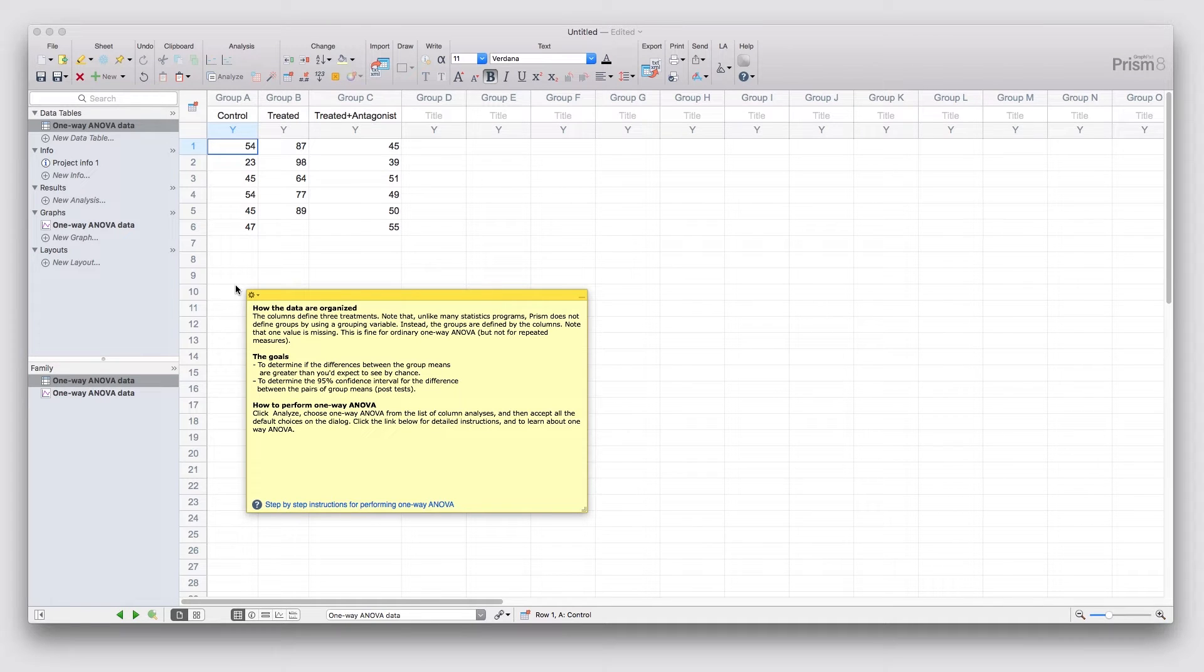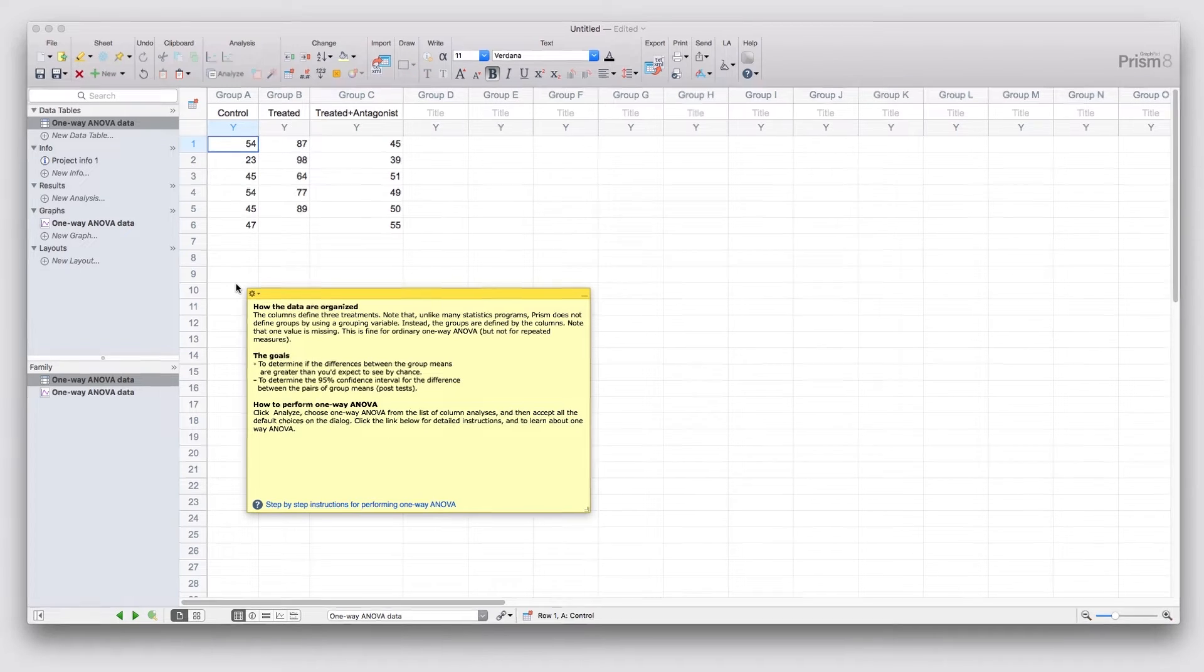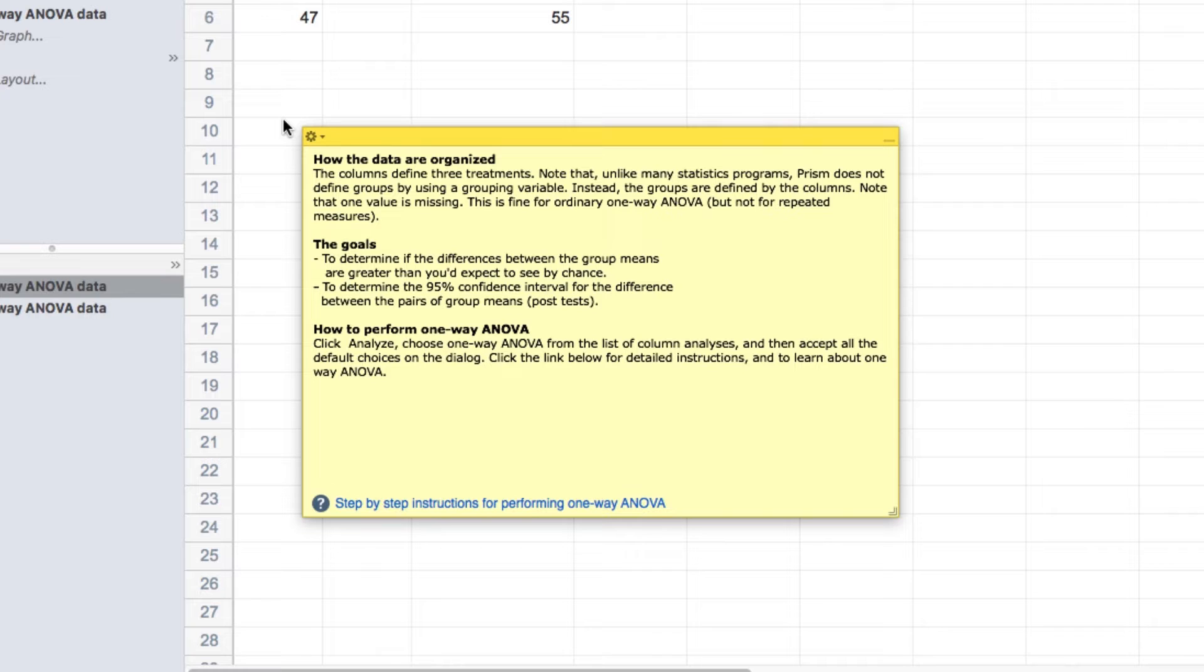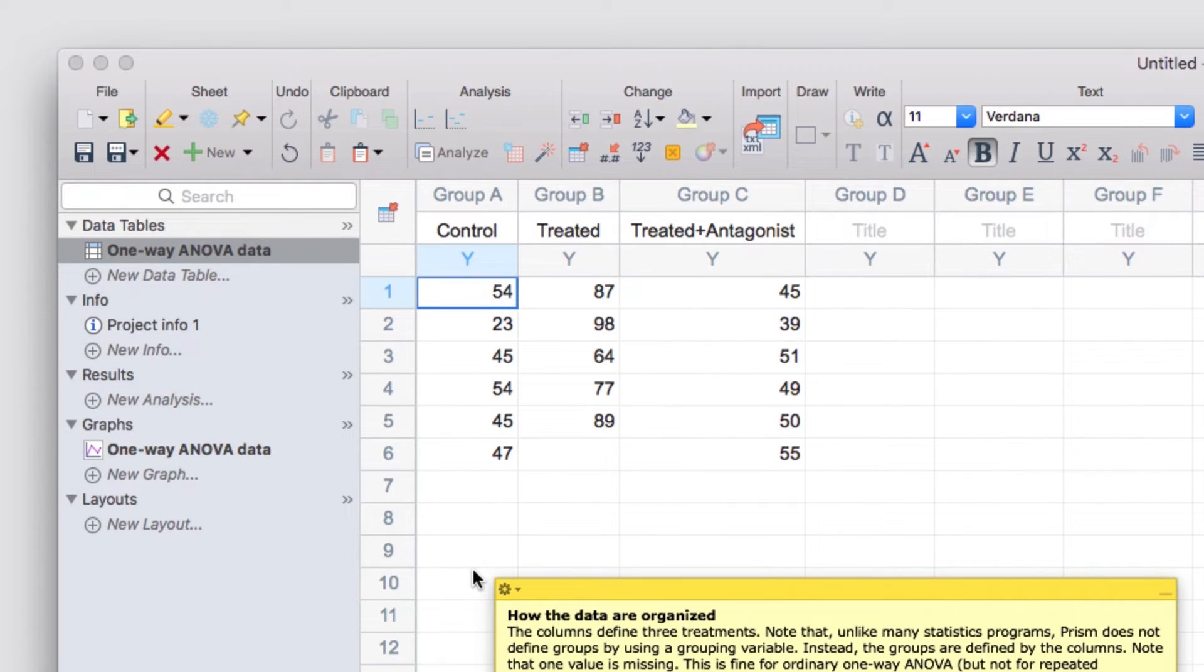However, like other tutorial data sets, this only shows you the data. You'll still need to perform the analysis yourself so you can learn how to better navigate Prism. These data sets will also provide instructions that cover the basic structure of how the data are organized, the goals of the tutorial, and some brief instructions for how to achieve those goals, which are typically to perform the analysis of interest, in this case a one-way ANOVA. These instructions are shown on a floating note on the data sheet, and you can add your own floating notes by clicking on the floating notes button in the sheet section of the toolbar.